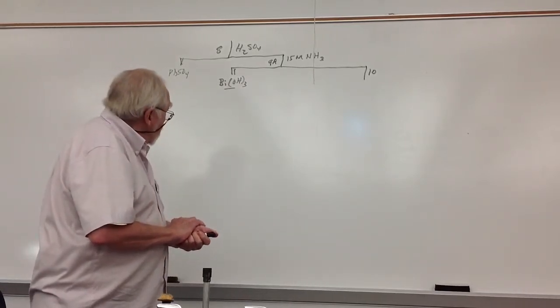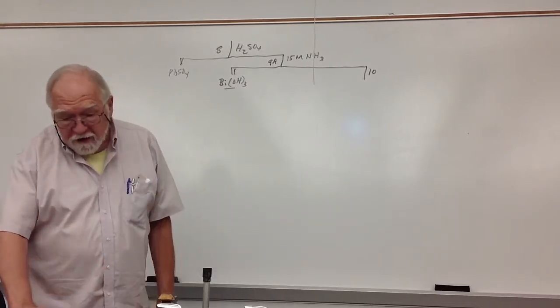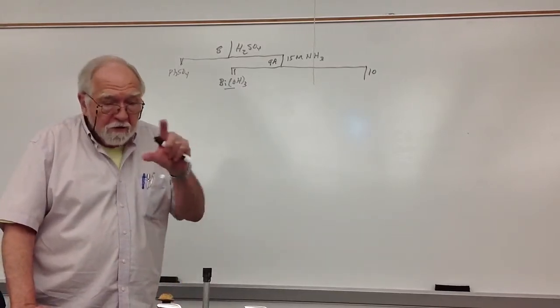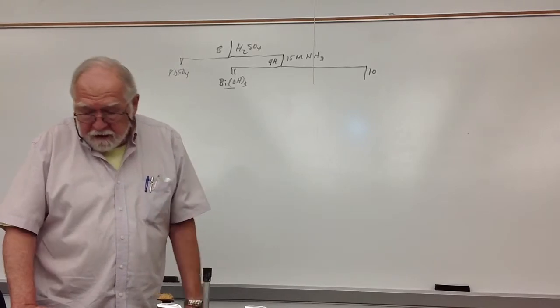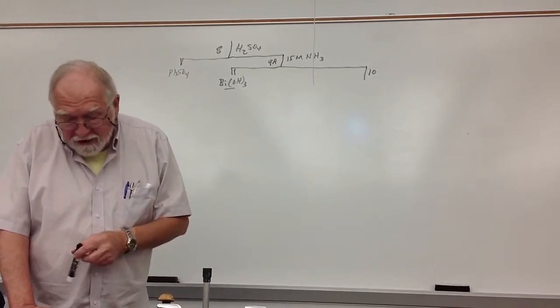you make the bismuth 3 hydroxide. It says add 8 molar NaOH. You want it very basic. And then you're going to add the tin 2 chloride. Now there's a bottle of tin 2 chloride in that set of 8 things that I put to the side to make up your unknown, or make up your known. So you can find it there on the other reagent bench. It's under tin 2 chloride, I guess.